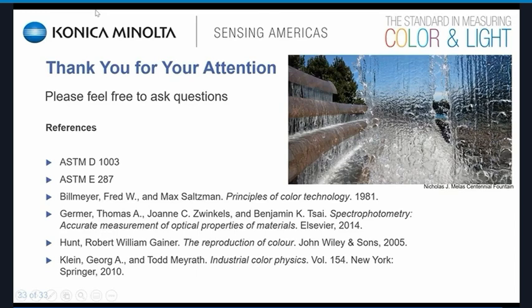What is the maximum percentage range of haze that, if you exceed, would call for opacity measurements? So the ASTM standards recommend switching from haze to opacity when the haze measurements exceed 30%.